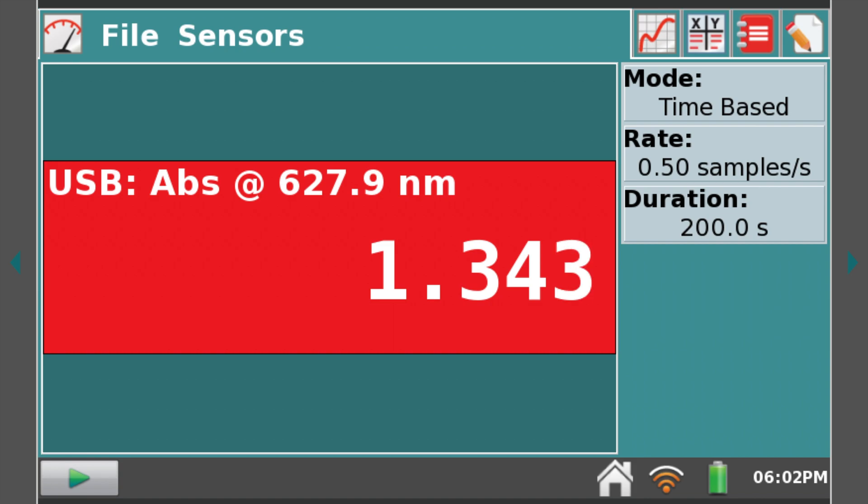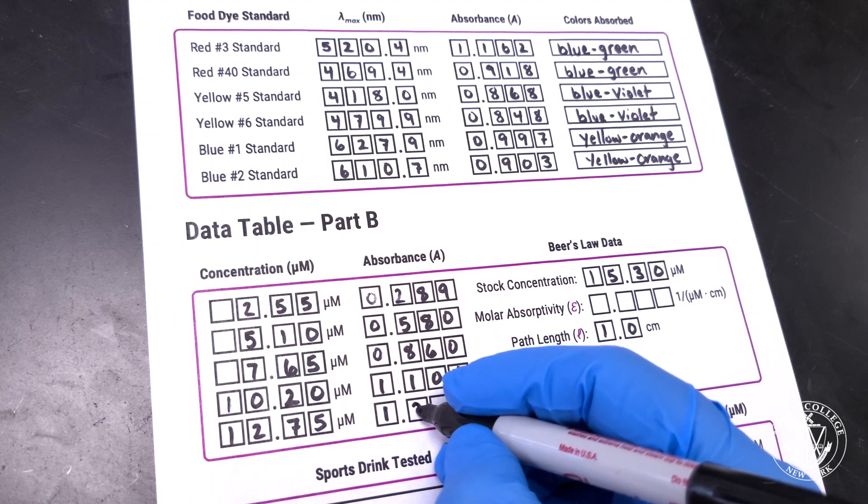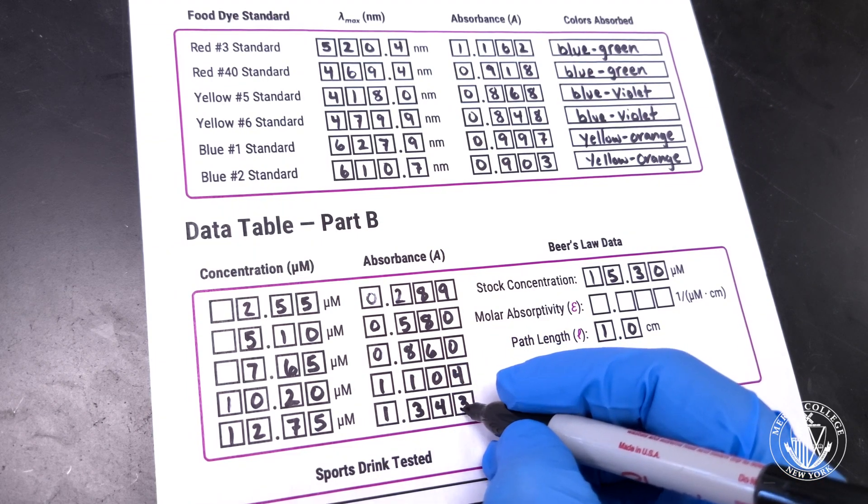The most concentrated dye standard appears to have an absorbance of 1.343.